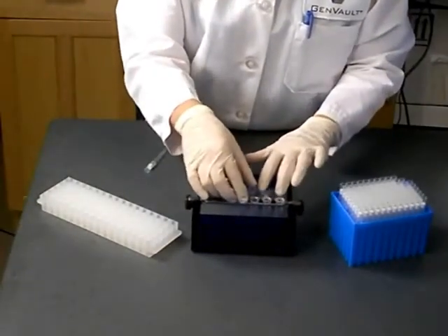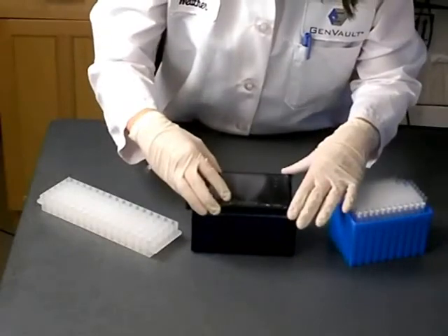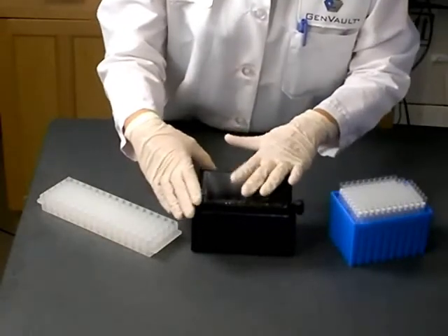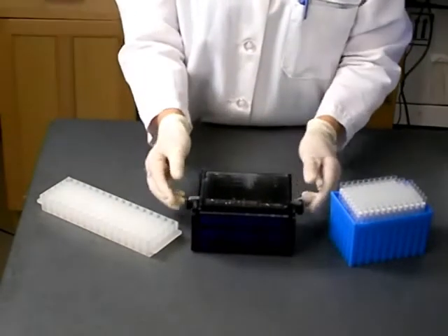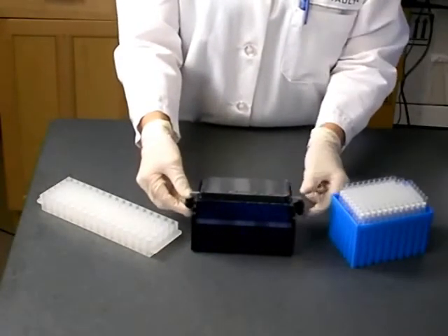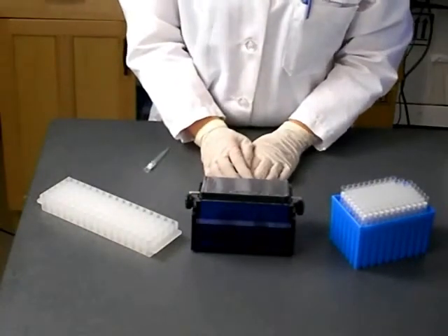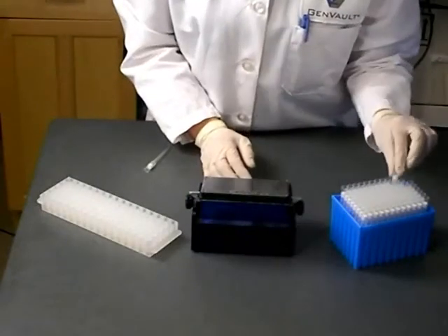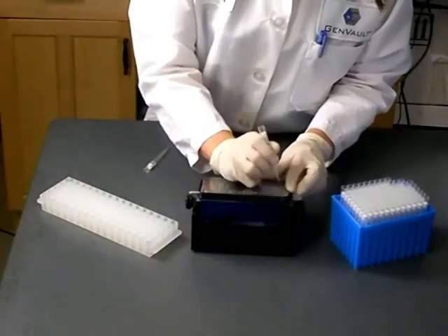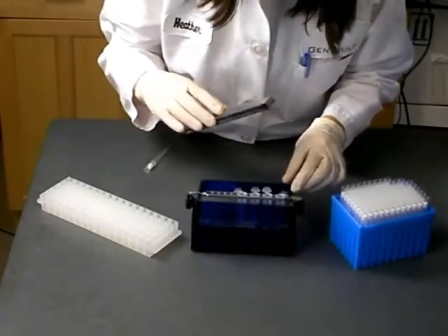Place the GenPlate onto the positioning stage over the tube holder and tube. The GenPlate should fit securely into the grooved corners of the positioning stage. Using the knobs on each side of the Gen Punch, adjust the tilt of the stage to a comfortable position and tighten the knobs. Visually locate the element for removal, then using a P1000 pipette tip, push the element through the adhesive seal and the foil bottom seal. Remove the GenPlate, then remove and cap the 2ml tube. Repeat until you have removed all of the GenPlate discs.